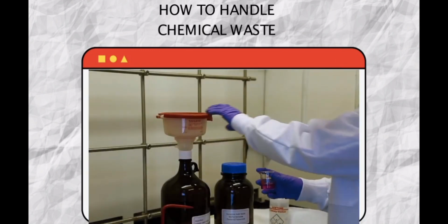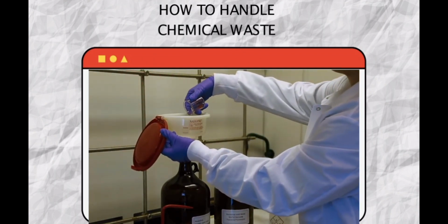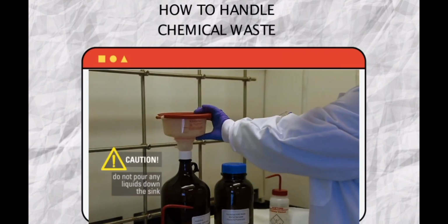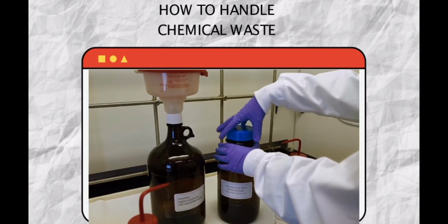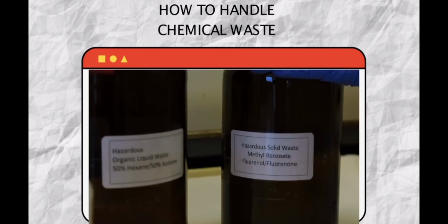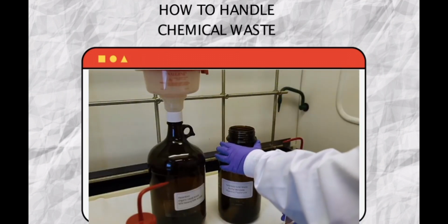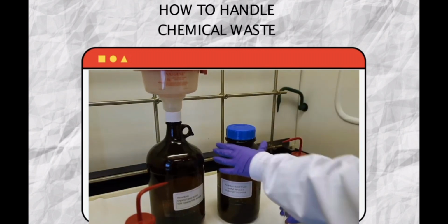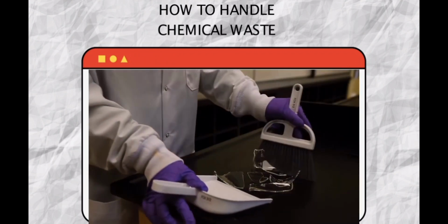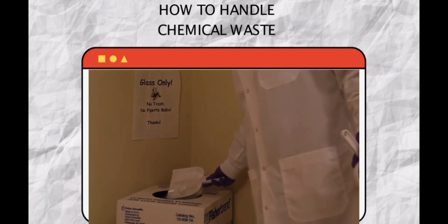Use the attached funnel to pour all liquids into the bottle. Close the top of the funnel after every addition of waste. Do not pour any liquids down the sink. Solid waste does not go in the trash. Place all solid waste from the experiment into the container labeled for solid waste in the fume hood. This includes the products of your reactions as well as any excess reagents that were not used. If any glass was broken during the experiment, be sure to carefully discard it in the broken glass container.